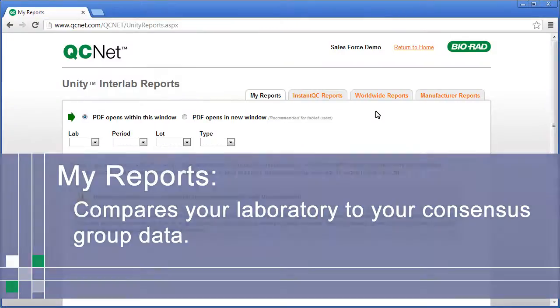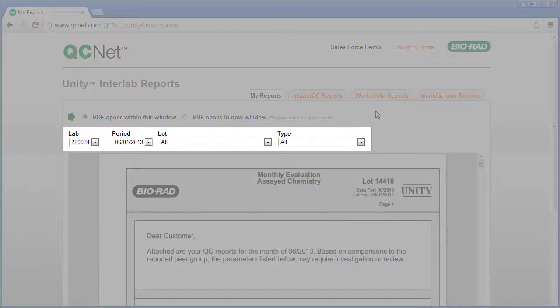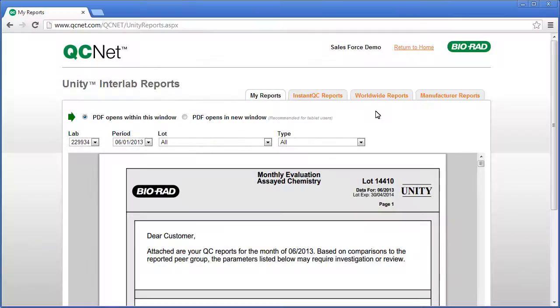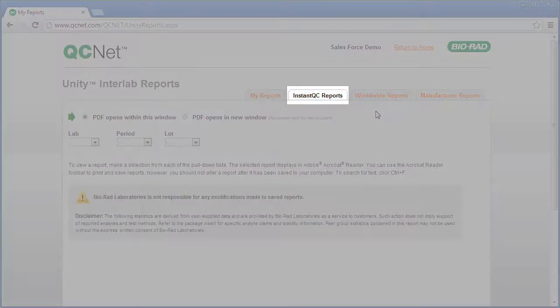The first is My Reports. This compares your laboratory to your consensus group data. Select the desired parameters and QCNet automatically generates a report. Next, we'll select the Instant QC Report tab.